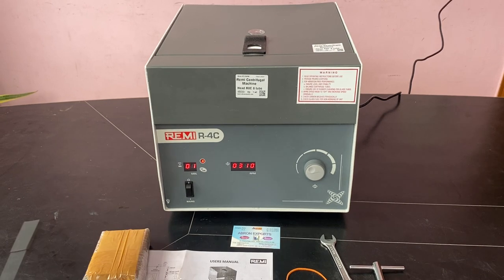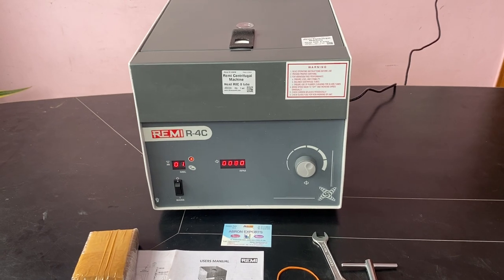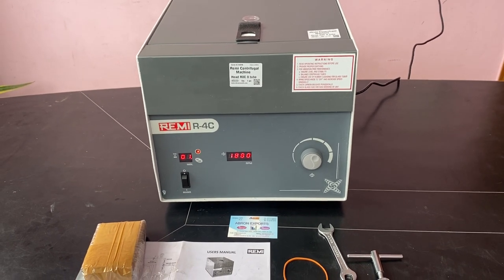It is a very silent machine. The RPM is now 3300. You can increase it — it goes up to 4000 RPM, with the 15 ml tube.